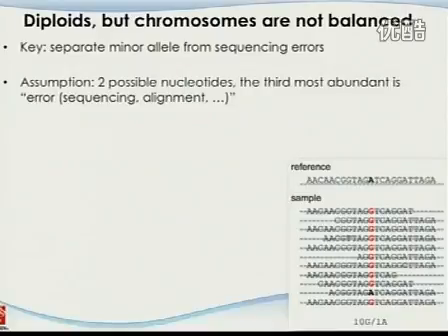If there is, the analysis itself may need to be changed a little bit, which is possible. We know that for a very small percentage of genomic loci, there are tri-allelic sites, so one location can have three different letters, not in one individual, but in the human population. When we put the samples together, it could happen.